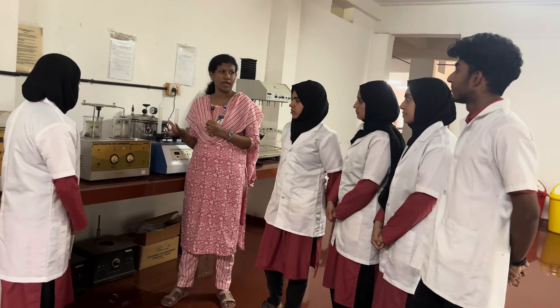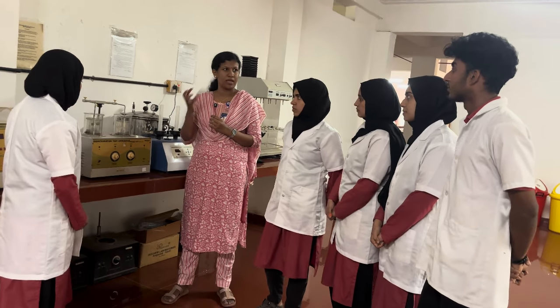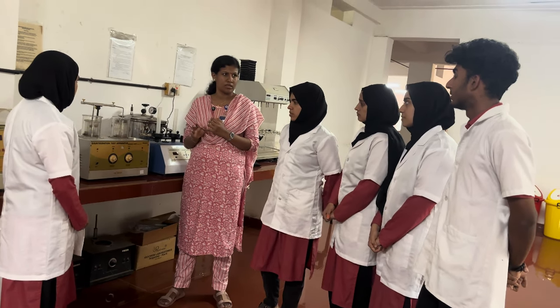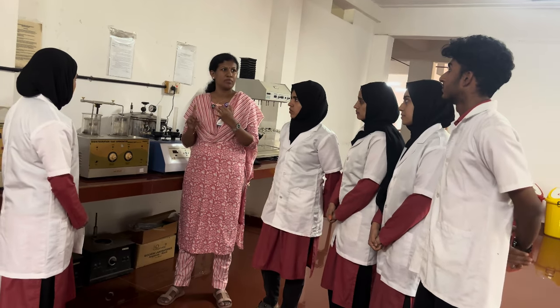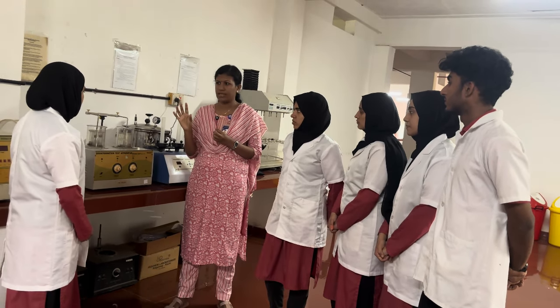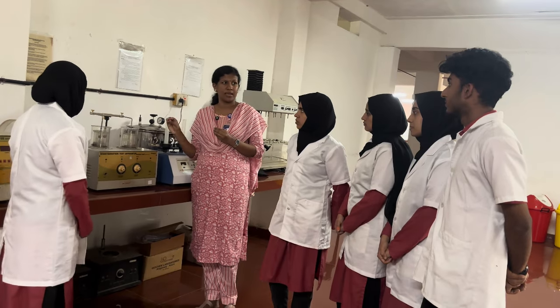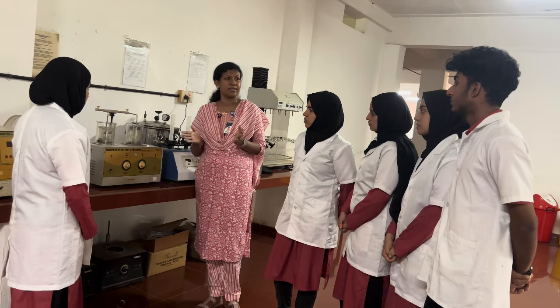Disintegration time for tablets. So we are preparing different types of tablets, and the disintegration time will be different for each tablet. For example, we are taking uncoated tablets, enteric coated tablets, film coated tablets. So the disintegration time will be different for each tablet. Then, in which tablets do we have to conduct the disintegration test? In which types of tablets should we not conduct the disintegration test?